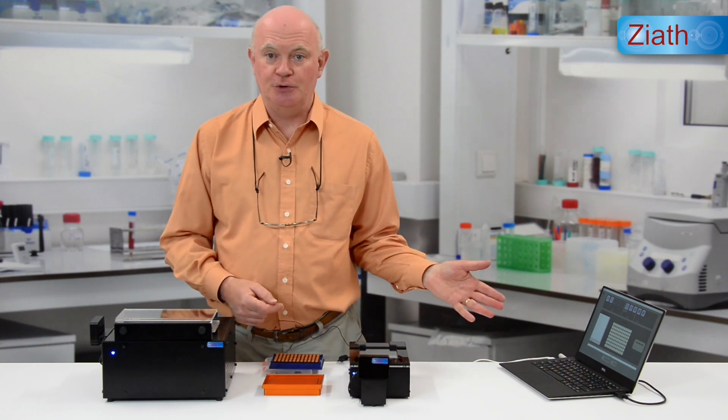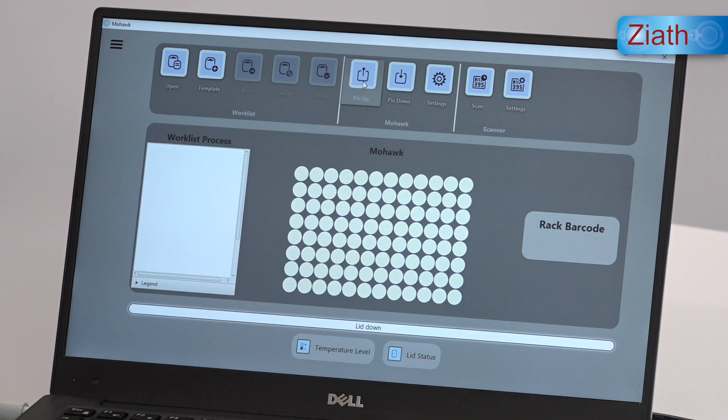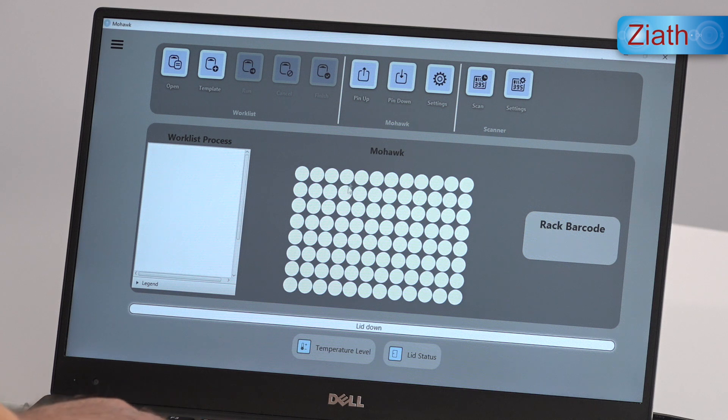First of all let's fire up the Mohawk software. On the laptop screen here you can see the Mohawk software running, and we have a 96-well grid on which we can select individual tubes to be picked. Each highlighted tube turns blue so we can see where they are.